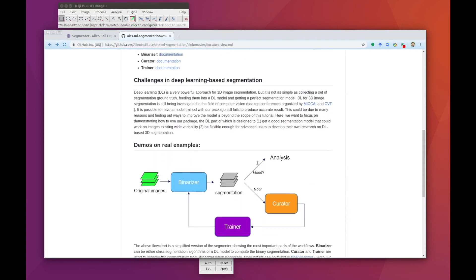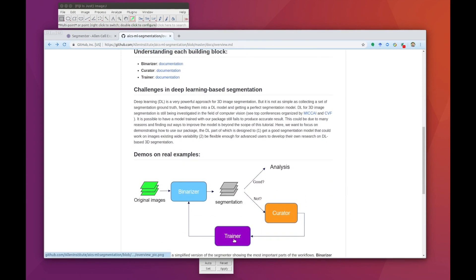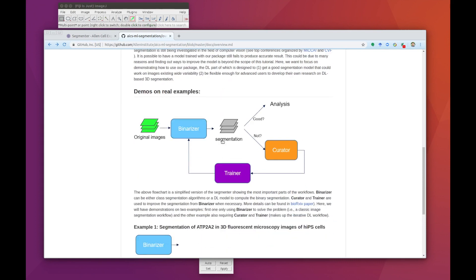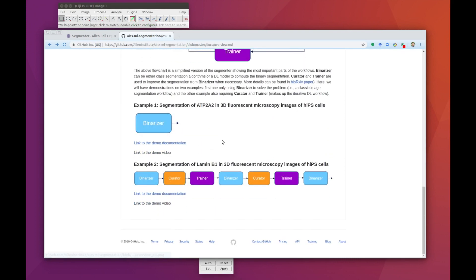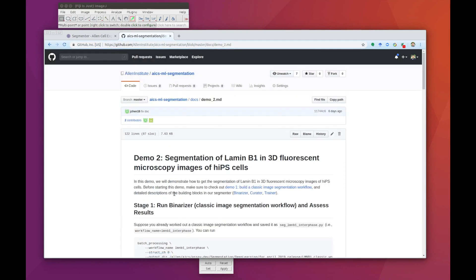Running the Segmenter relies on three building blocks: the Binarizer, Curator, and Trainer. We'll explain how to use each building block in a real example. Today we're going to be applying these tools to segmenting Lamin B1 cells, and all of the sample data being used in this demo will be accessible on our web page.